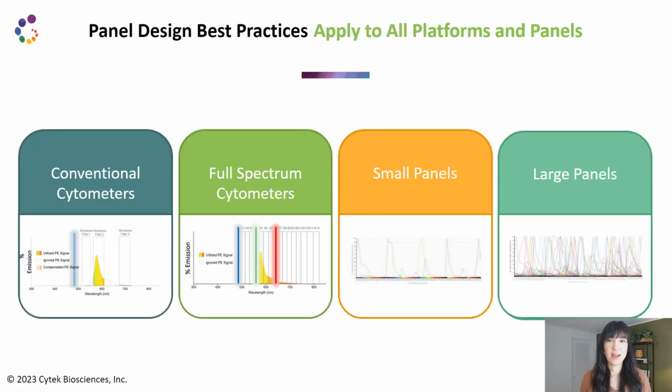Okay, so I am going to cover a lot of panel design best practices today. And I want to start out by making the point that pretty much everything I talk about today, you can apply to all platforms and panels of all sizes. So it doesn't matter if you're using a conventional cytometer or a full spectrum cytometer or whatever panel size you are using, I should be able to give you some really good information today.